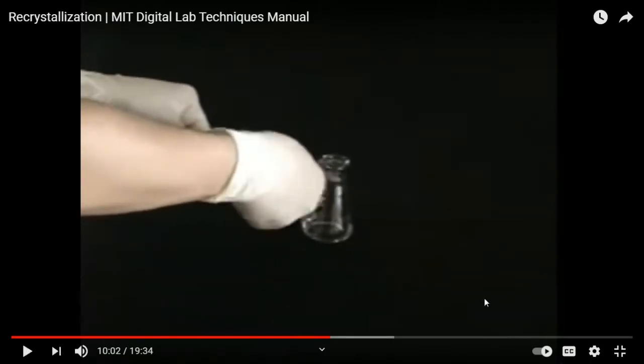Even when you are cooling, pay attention. They're not cooling in the ice bath. Okay, this is not Gen Chem. Cooling doesn't mean ice bath. There's a very delicate process about crystallization. The first time in human history they got the DNA X-ray picture, it was done by crystal. Crystallization is not just making some solid. Solid is not crystal. Crystal is special. Okay, we're not there yet to discuss crystals.